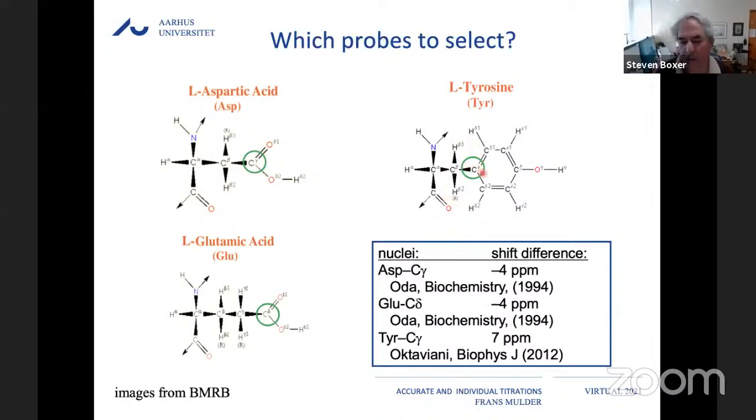I see. Okay, so it is very NMR specific. I guess in our case, we were just lucky. We could directly see that carbon, and it is super sensitive. But if you do one-dimensional carbon NMR, it's fine, because this carbon is also immune to the flipping.